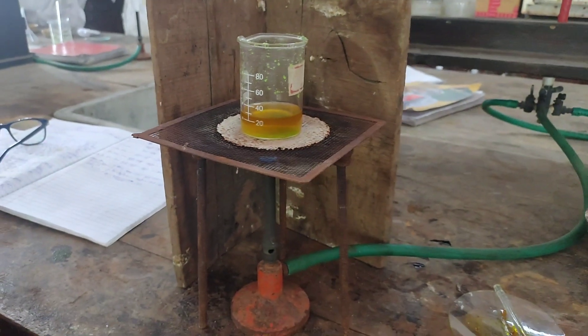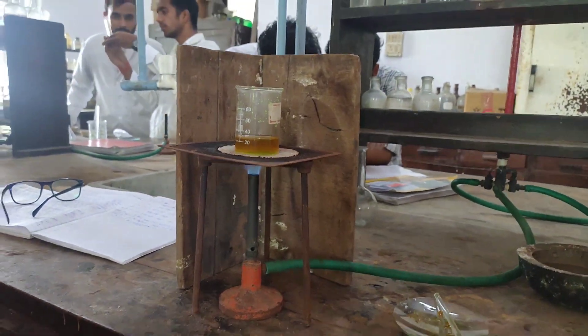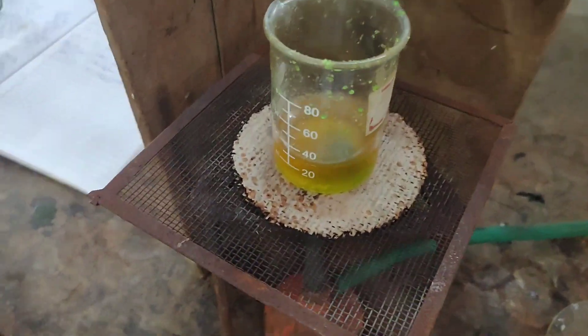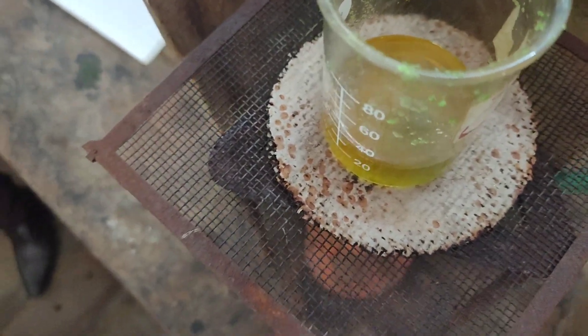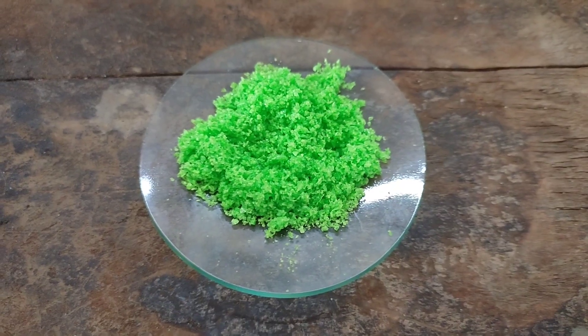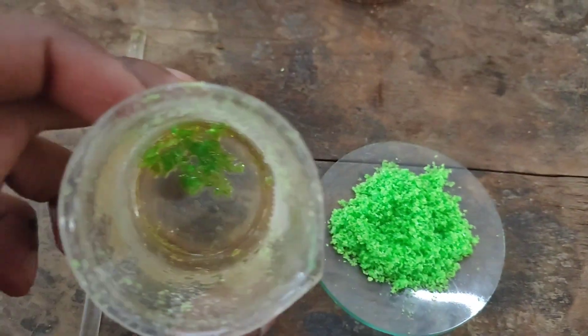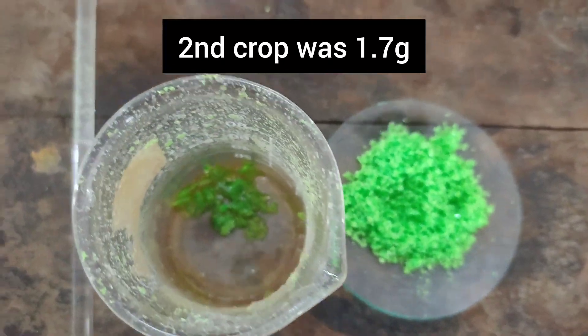The mother liquor was evaporated to half of its volume and then again cooled to get the second crop of crystals. In the first crop, we got 7.0 grams of crystals, and in the second crop, we got 1.7 grams of crystals.